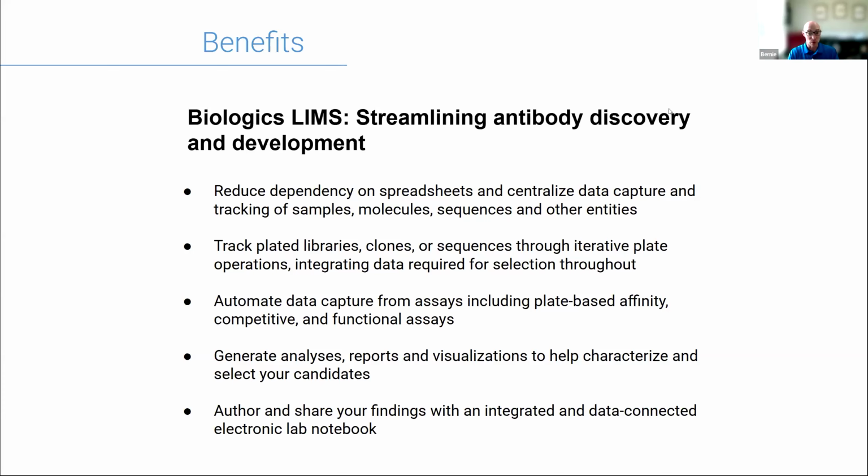It allows you to ultimately keep track of your materials a lot better, both for reproducibility as well as using that material for something else in the future. We will help you maintain the uniqueness of the entities in which you're operating. That's your molecules, your sequences, things like that.